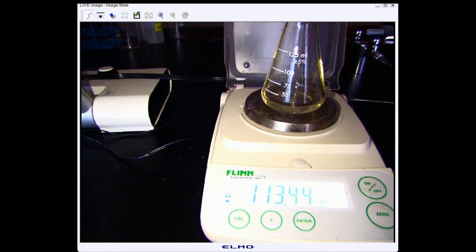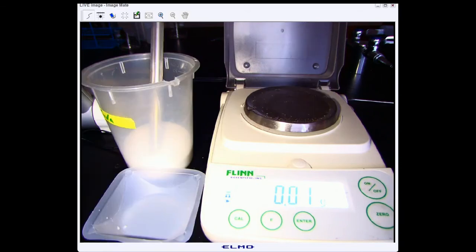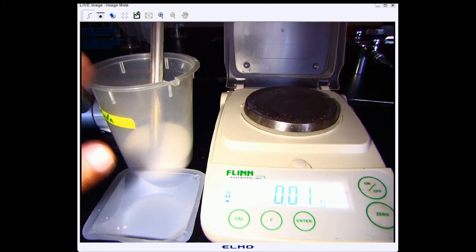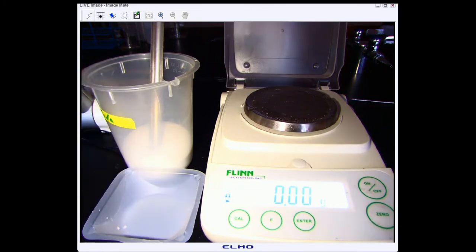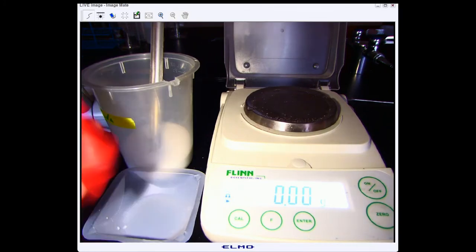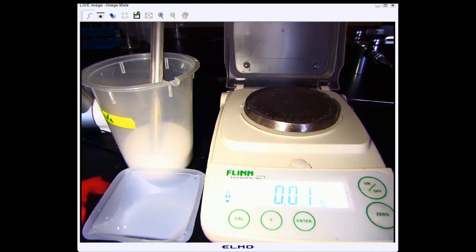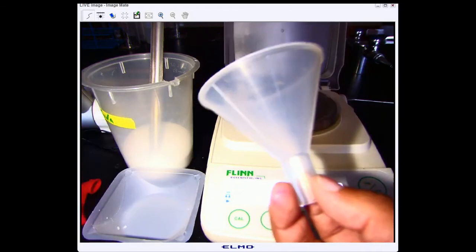Now we're going to move on to the baking soda. Give me one second to set that up. All right, for the baking soda part we're going to need the wayboat, our baking soda, a balloon, and a funnel.